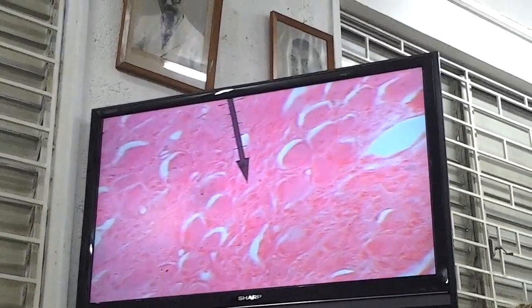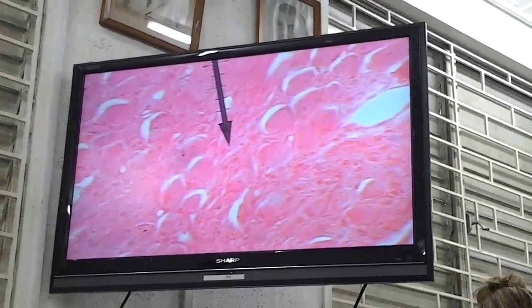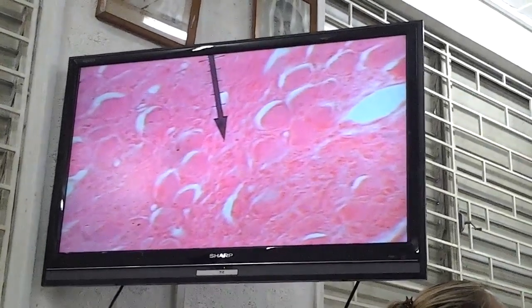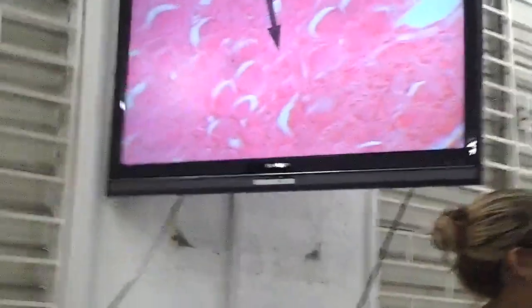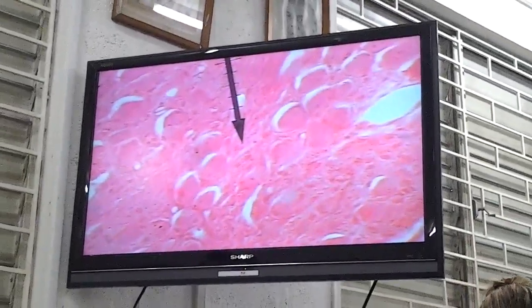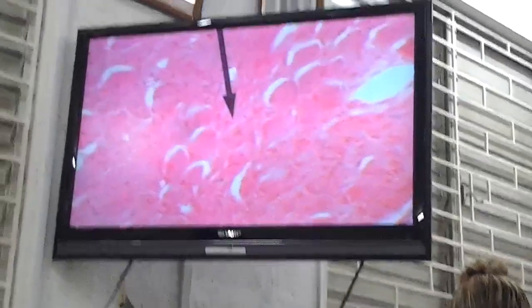No. So what I want you to do is just be relaxed. Okay, just relax and look at the images. Because the histology questions are not too hard in terms of what they ask, but it's to identify what's under that you're looking at. Okay? So the primary thing in both UP and Neuro Histology is what am I looking at?